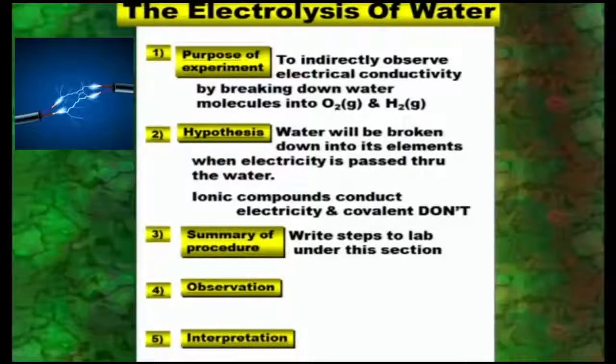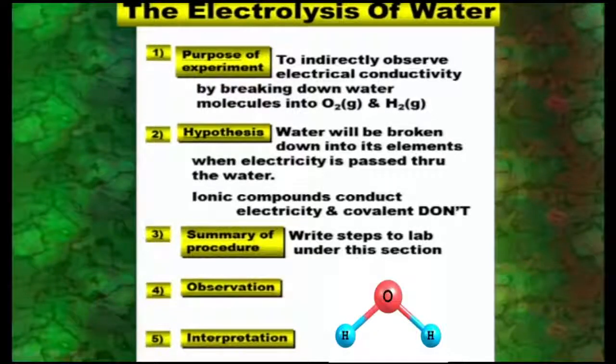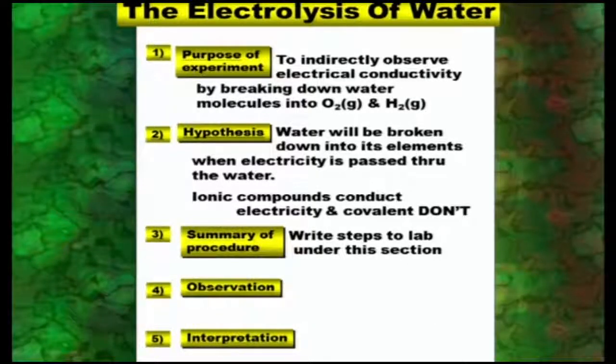Today we're going to have an electrifying experience. We're going to be looking at the electrolysis of water. Now before we get started with this, I know we all want to just get going with our experiment. We want to do a little bit of background information so that we can better understand what's happening.